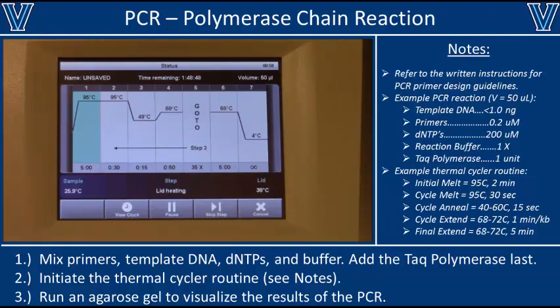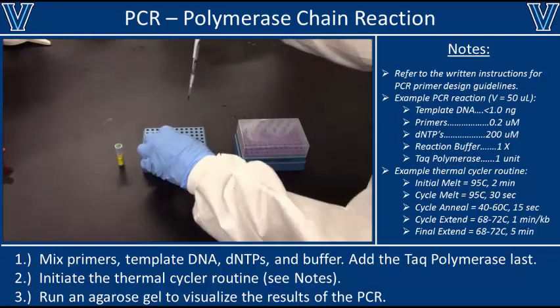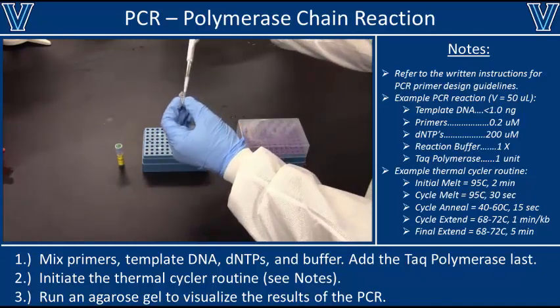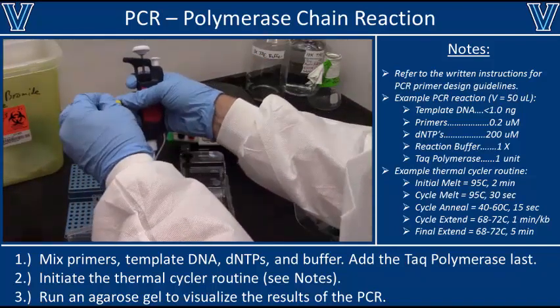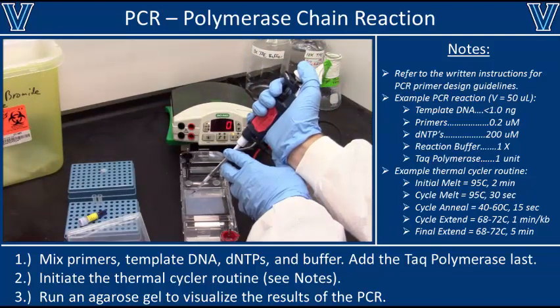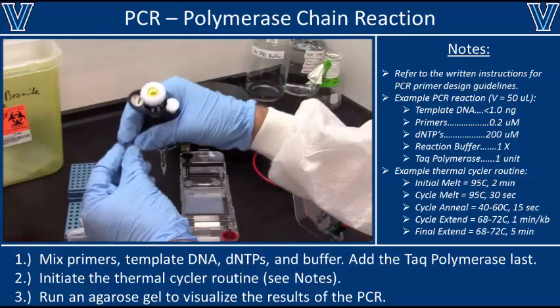Once your PCR reaction is finished, you'll want to image the PCR products on an agarose gel. Add DNA loading buffer to the PCR sample — here I'm adding 12 microliters of 5x concentrated loading buffer to the 50 microliter sample. Load 10 to 20 microliters of a DNA base pair ladder onto the gel first. This ladder contains multiple bands of known length that will allow us to confirm the length of our PCR product — we have an 800 base pair product, so we'll want to make sure it aligns with the 800 base pair band.